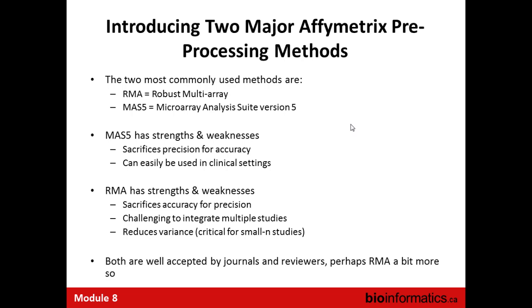When Affymetrix realized that other people were going to do the hard work and spend the money developing algorithms for them, they basically stopped. So the statisticians who fixed it also had the consequence that the company doesn't really do it, and they routinely release products now without a lot of depth of bioinformatic support available. The algorithms trade off strengths and weaknesses. They're both very reasonable ways of analyzing microarray data.